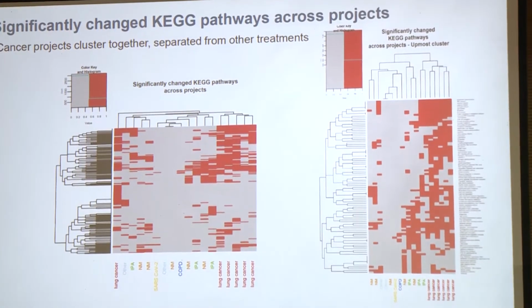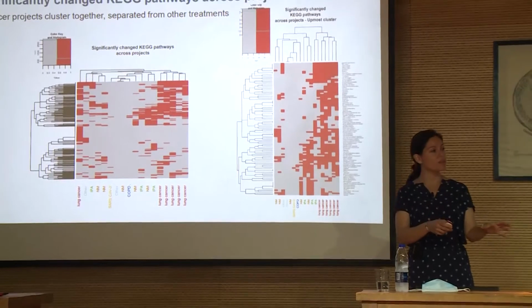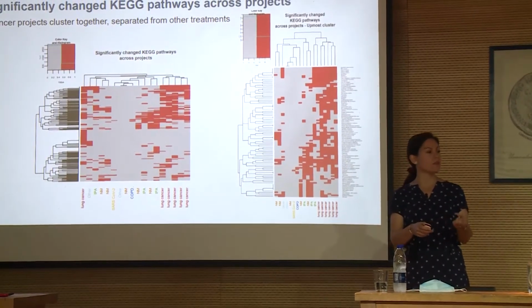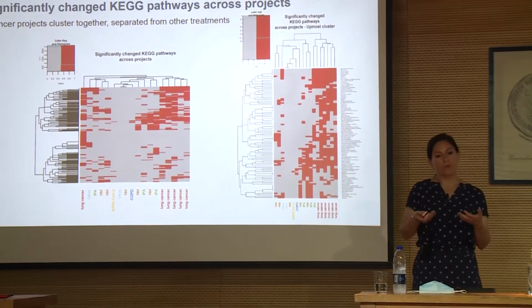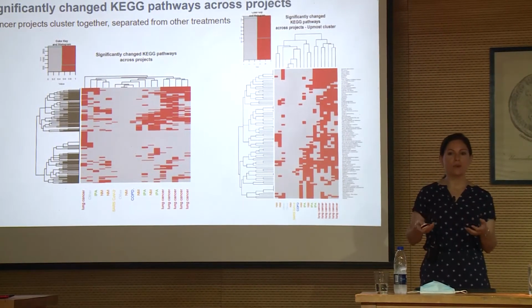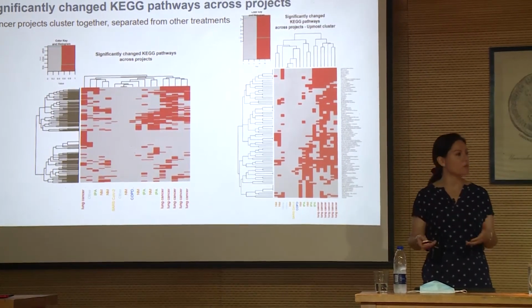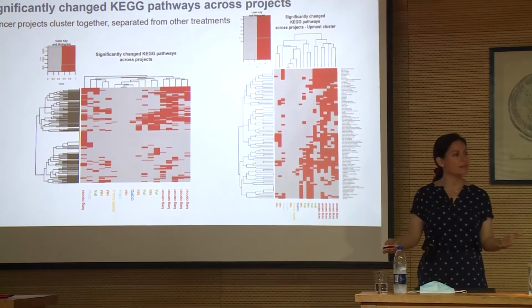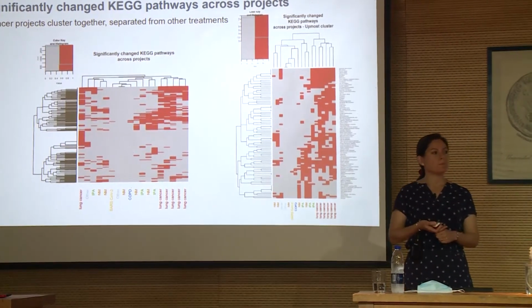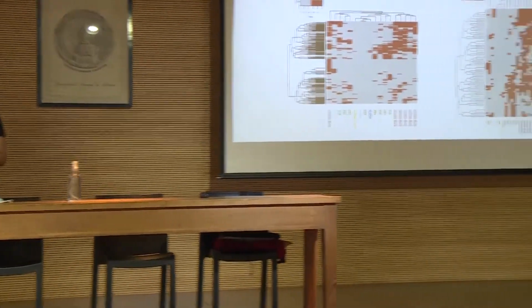They showed that nothing was significant, or some proteins were significant but not the descriptors, and then they are lost. But we believe that the strong part of this is that you can have very many projects and retrieve the information from the majority. Any question for Verónica? Jon over there.